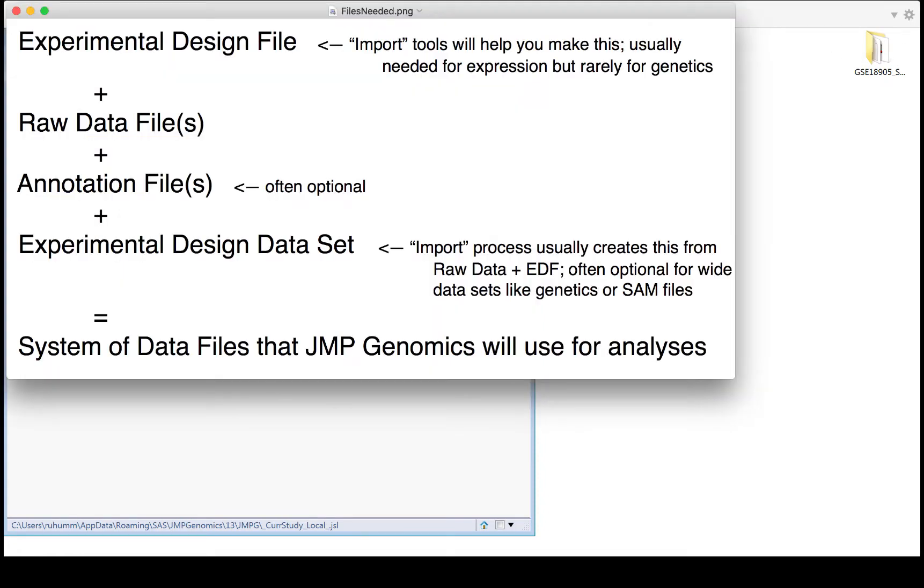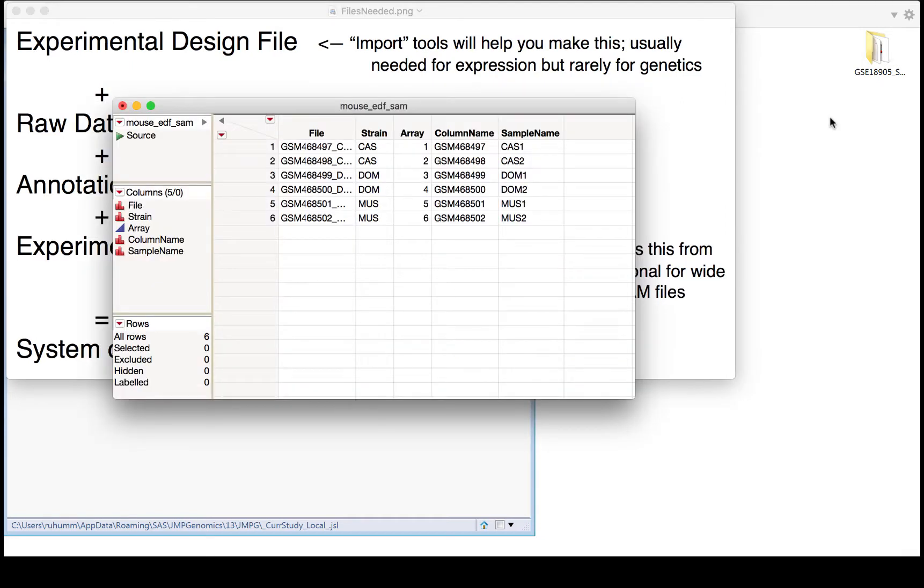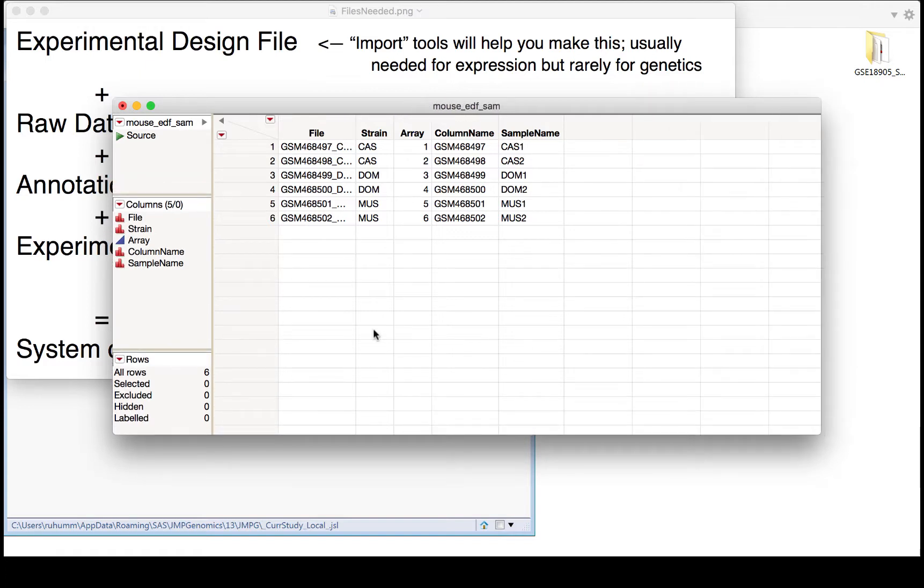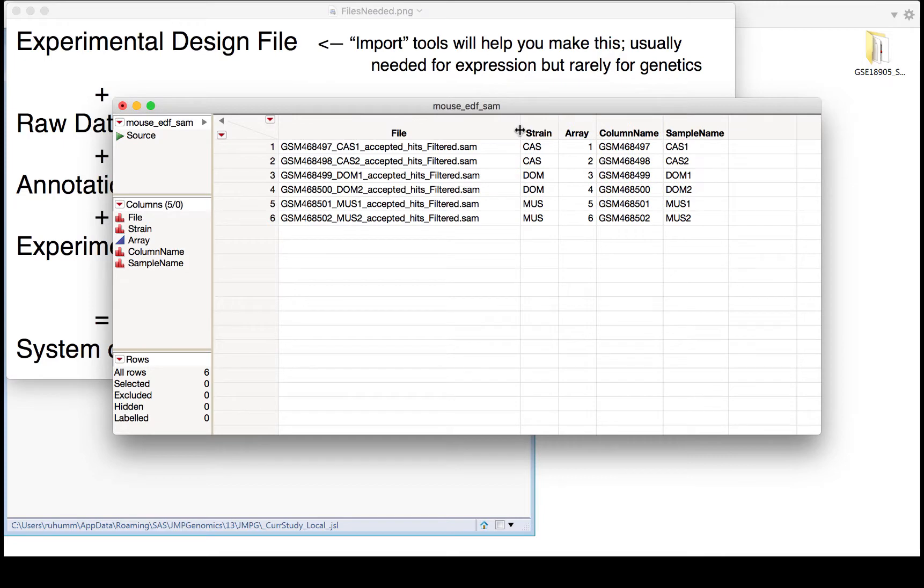These are the types of files that you're going to need when you're using JMP Genomics. First, you're going to need a special file called an experimental design file, which the import menu can actually help you create. Here's an example of an experimental design file. In this experiment, there were six mouse samples, and this first column, the file column, lists the file names for the raw data files, which in this case are SAM files.